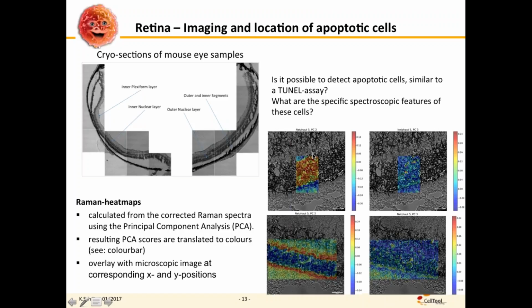at this area. As you see, we see the inner and the outer layer here, getting blue here a little better to see. And the idea was, would it be possible within such a scan to see apoptotic cells, because they are very difficult to see with current methods. And if you look carefully, we see some little yellow dots. Sorry, maybe I should enlarge this next time. And we assume that these little dots that we see here are due to apoptotic cells.